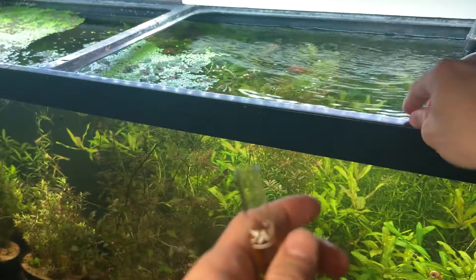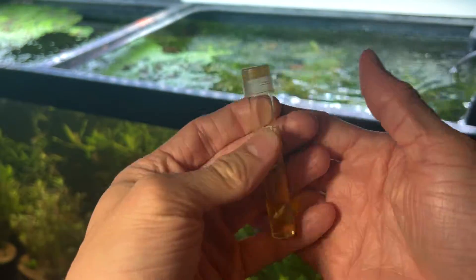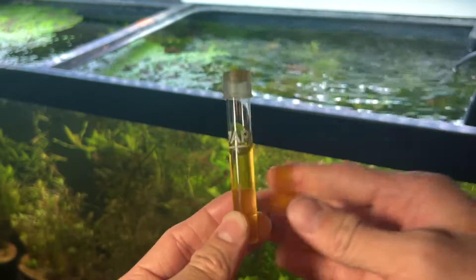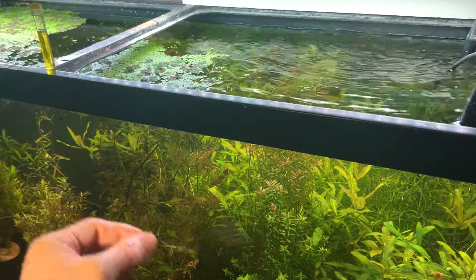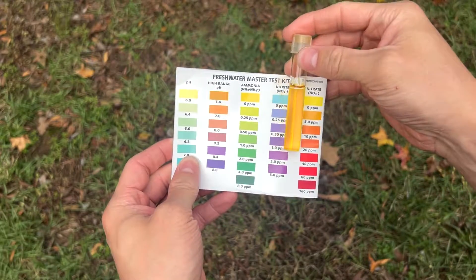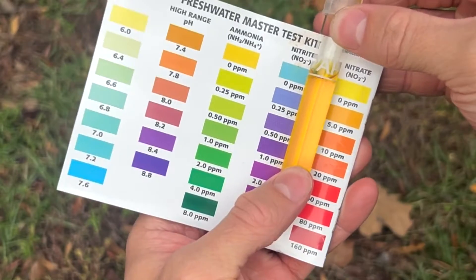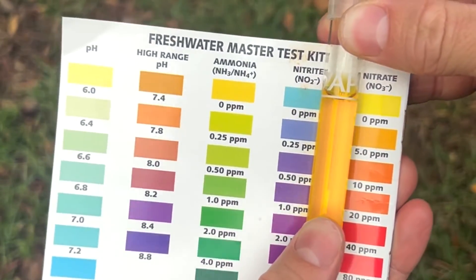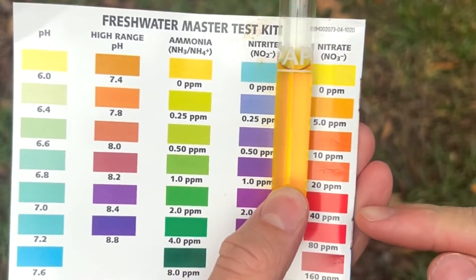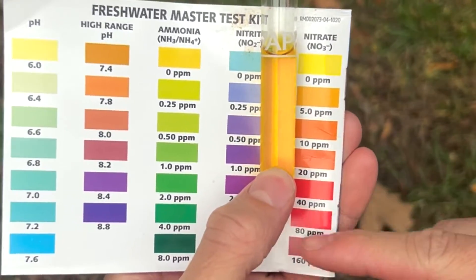Now add the cap and give the tube a good mix, then let it sit for about five minutes to let the mixture set in. For the most accurate nitrate reading, test it outdoors in sunlight, as that's the best light to use. Lining it up with the graph, we appear to be at a bright yellow to slightly orange, which means we are in the safe range. If your nitrates are at 40 ppm or higher, you need to do a water change immediately as those levels will be harmful to your livestock.